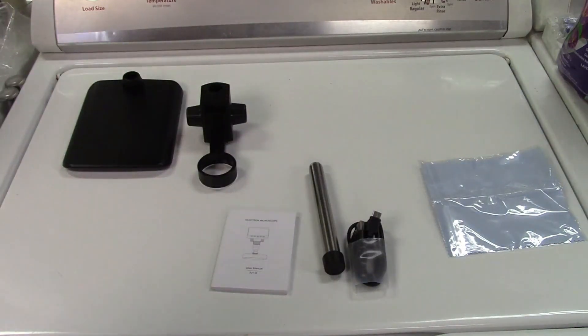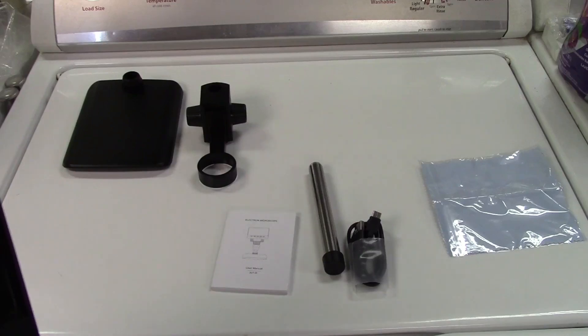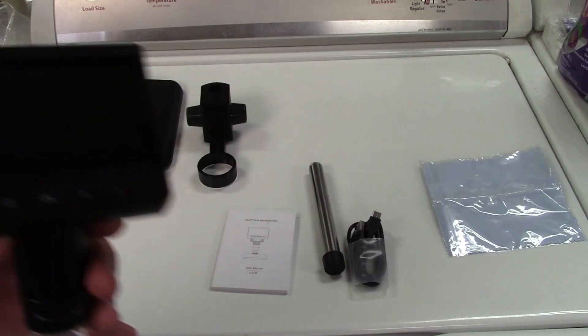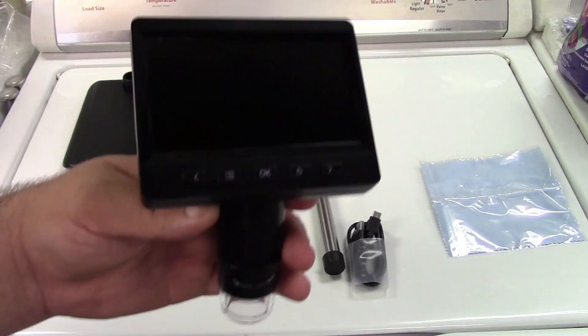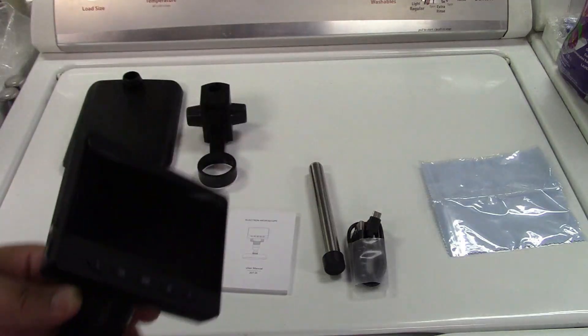hooked up to an even larger screen, mirrored for example, it can output there and then you can see really, really big. But we need to put this together.